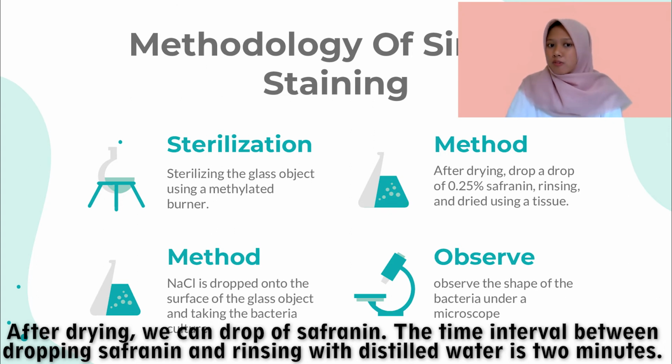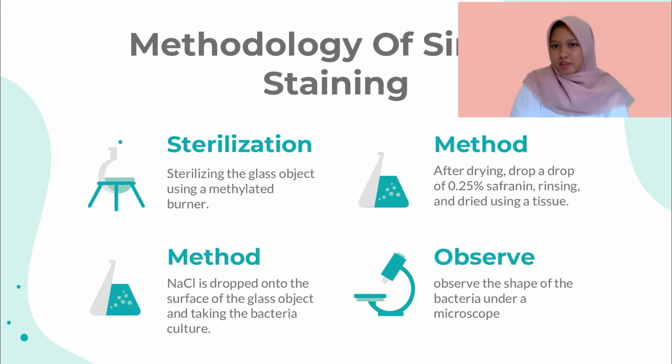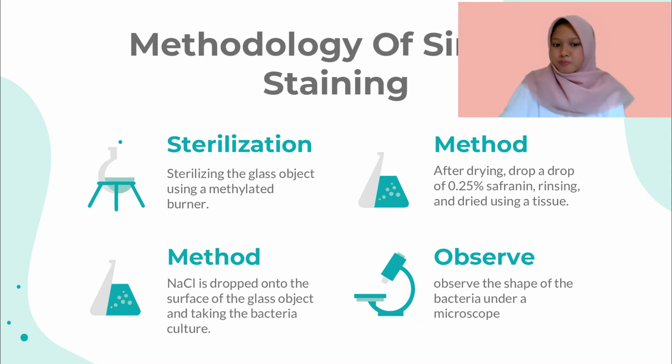The time interval between dropping safranin and rinsing with distilled water is 2 minutes. If it has been rinsed, it can be dried using a tissue. The last step in simple staining is to observe the shape of the bacteria under the microscope.